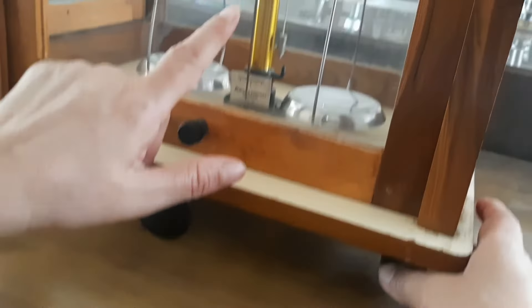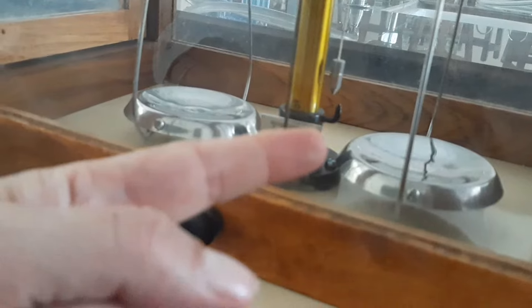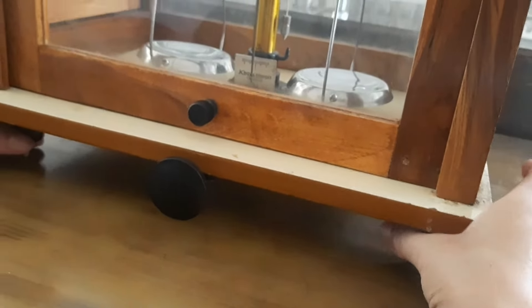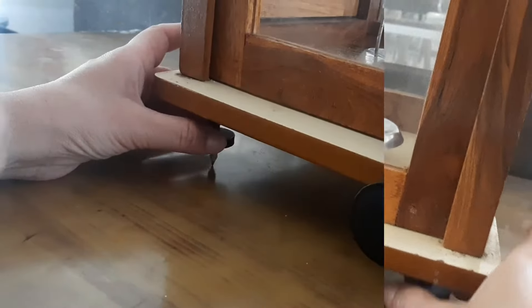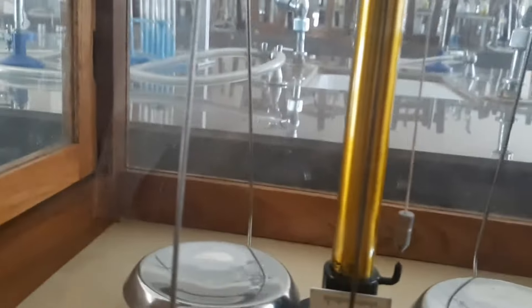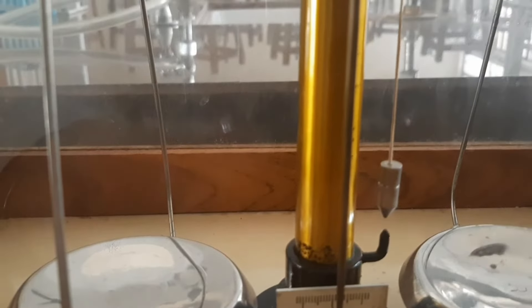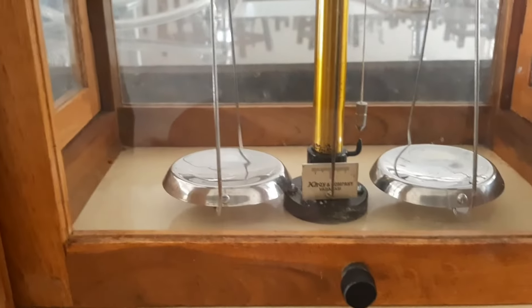I'm going to make adjustments to bring this plumb line in line with the pointer below by turning the screw on both sides. I'm moving the screw in the clockwise direction, and you can see the plumb line has come in line with the pointer below.